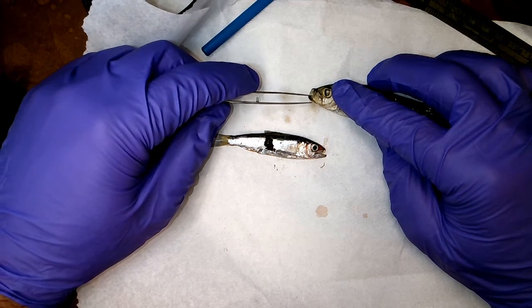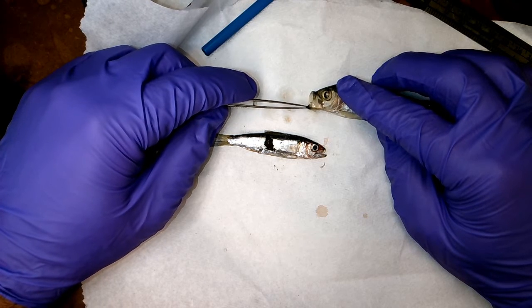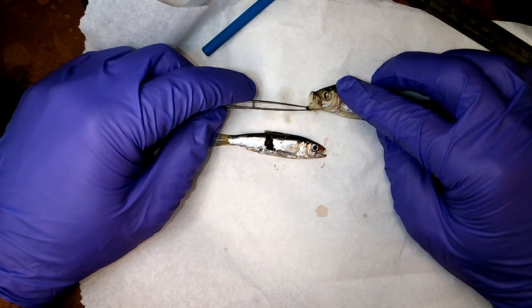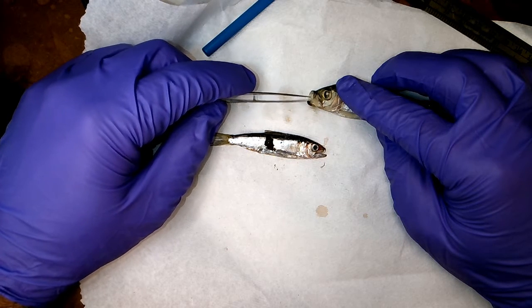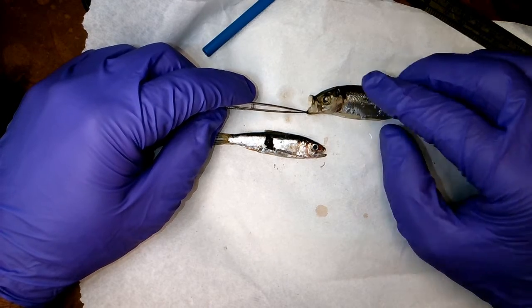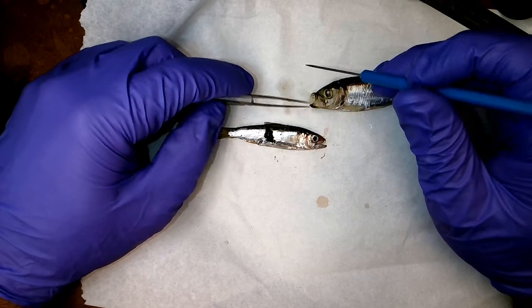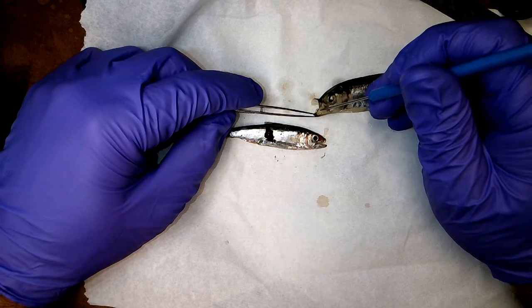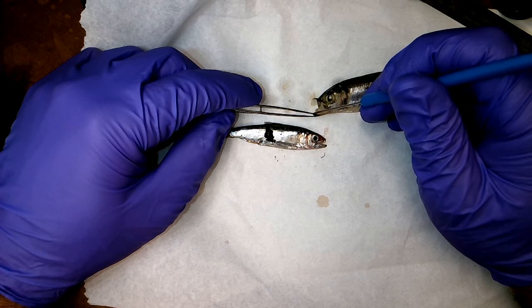But open the lower jaw, and you're looking for that shovel that occurs just at the end here. Starting here, starting up here, ending down there. I need about 5 more hands to make this really clear. But you want to look at this part right in here.